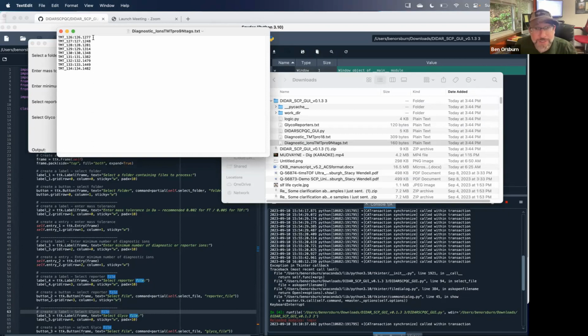In most cases, I don't want to count. Now, if I'm just using this for QC and I want to see how often 126, which is typically the blank, shows up, I want to see how many spectra pop up where there's measurable signal in the blank, then I would leave this here. If I'm actually using it for filtering and I want MGFs that are just clean spectra where there's no signal in the blank, but there's lots of signal in the single cell channels, then I'll delete this out.